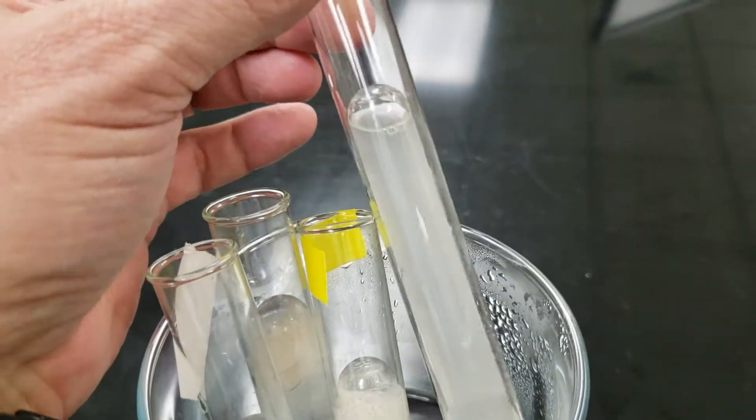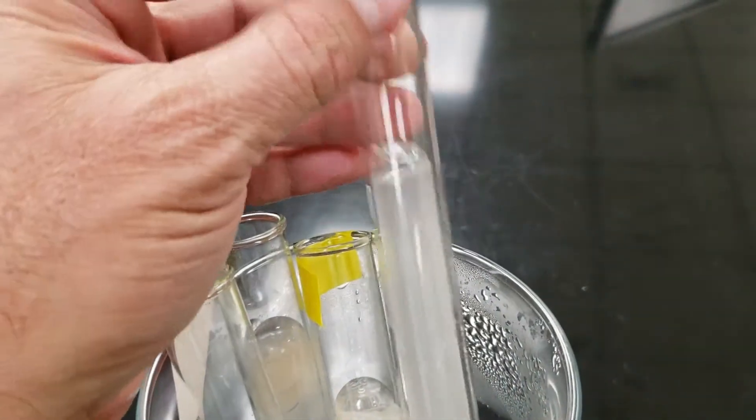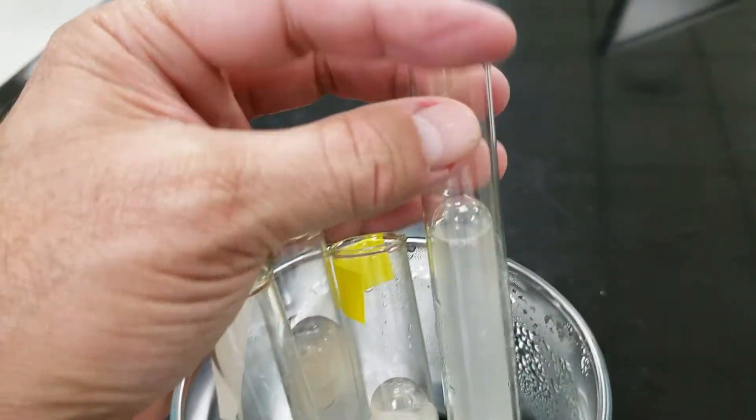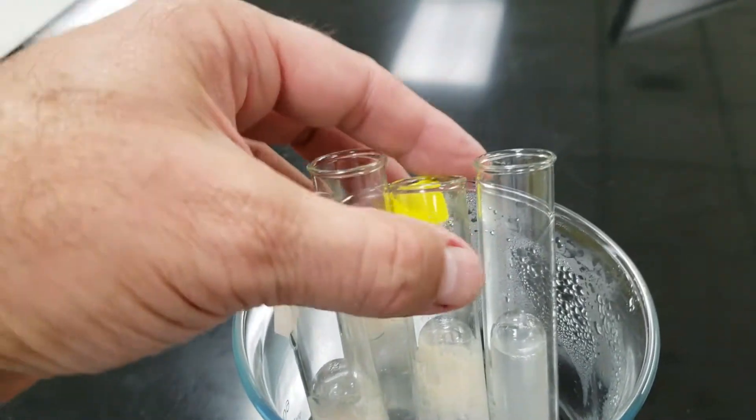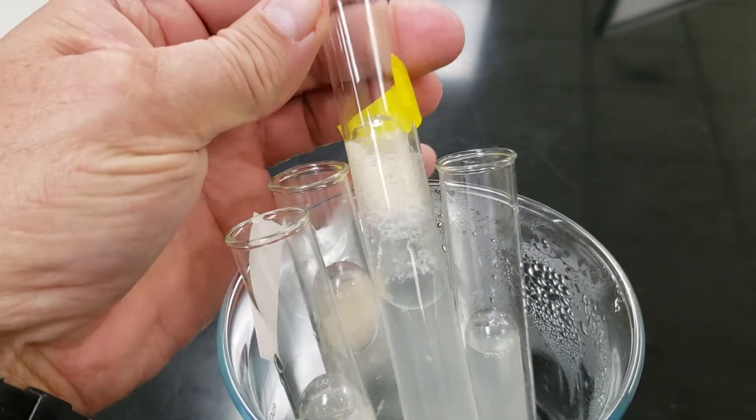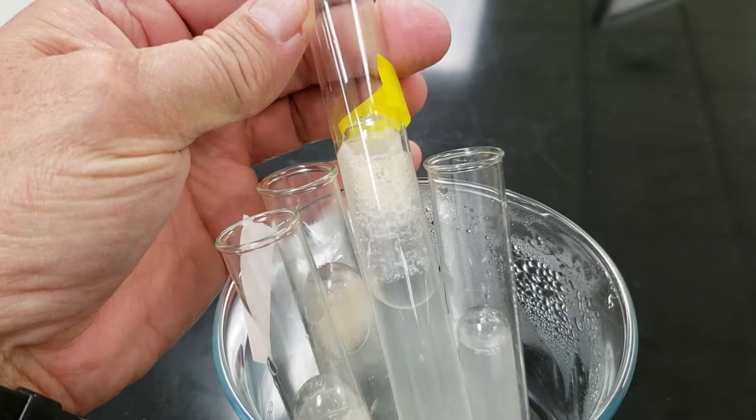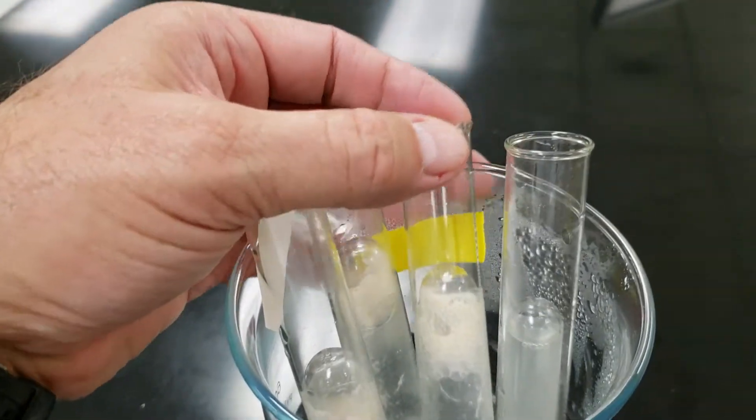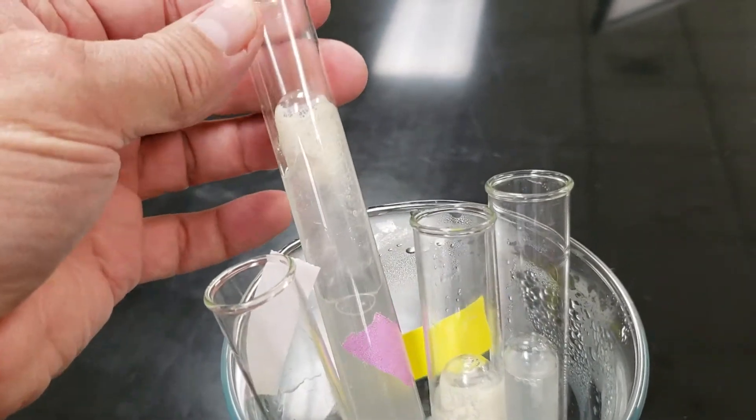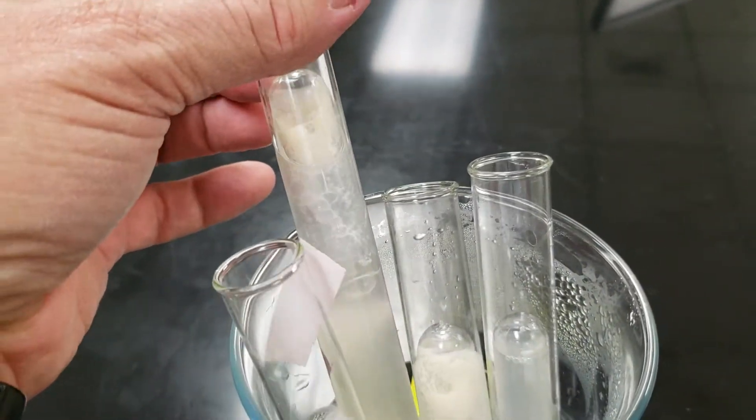Our control with yeast and sucrose shows not very much change. Here is one of our experimental tubes. Looks like we got 40 or 50 millimeters of carbon dioxide with that one. Maybe about the same here.